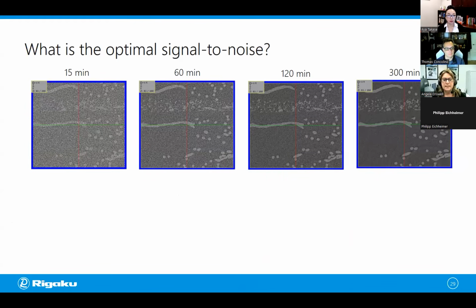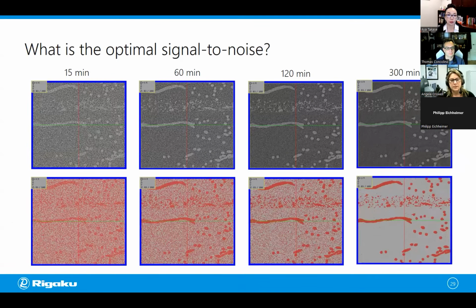Let's say we're going to segment these using simple Otsu binarization, meaning we pick a single threshold where we can segment each of these. It's not possible until we get to the higher exposure times. For these, there may even be some noisy pixels that are chosen, but Otsu binarization is the simplest way to segment, and if you can do it with this, then you're on the way to success.